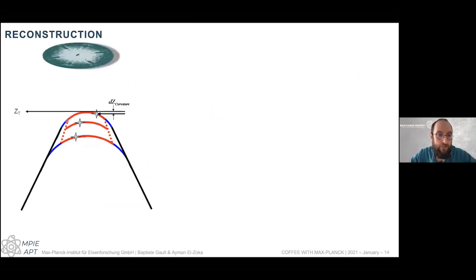So the way we do this is that we assume that the atoms are sitting on the spherical cap at the apex of the needle, and they reach the detector. So they follow a certain projection from the surface onto the detector. And so we assume that we have a clue what this projection law actually is, and we can backtrack this impact position onto a virtual emitting surface.